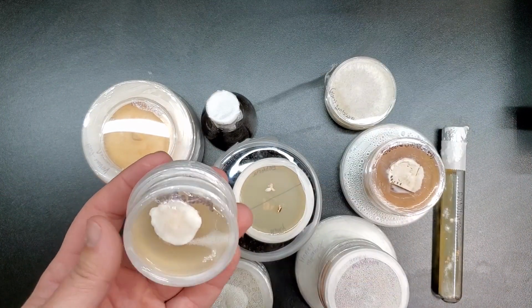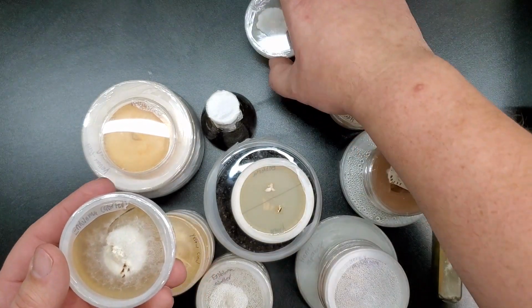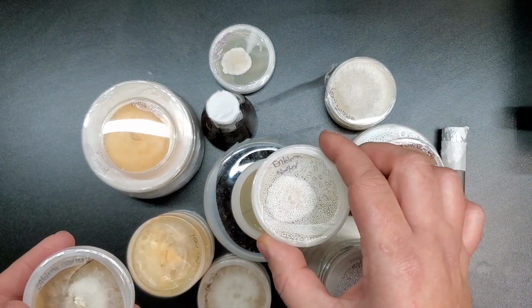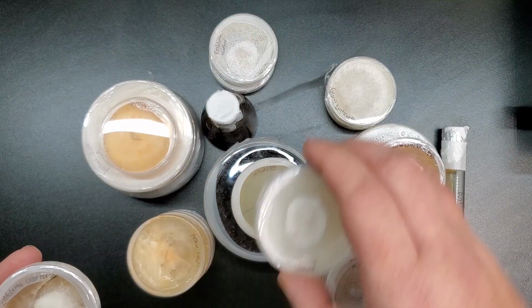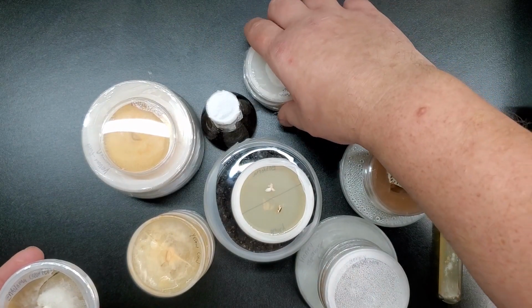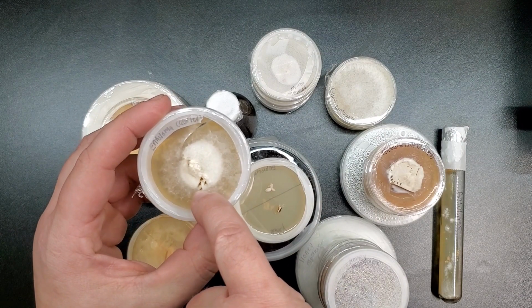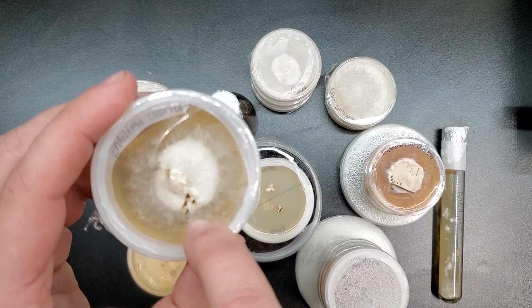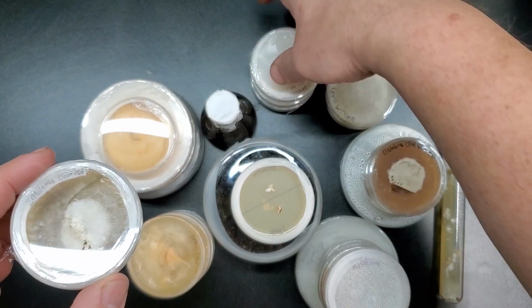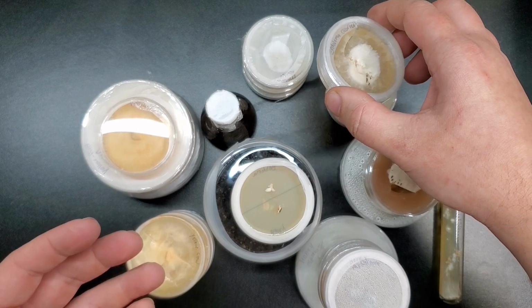And this right here, this is actually a transfer that I did from one of the original petri dishes that I inoculated with tissue sample. Same goes with this one, and same goes with this one. These are all tissue transfers that were from, I think it was this one right here. Yeah, you can see right there where I took some of the tissue, some of the mycelium from this guy, and I used it to inoculate these petri dishes right here. And as you can see, things are actually going really, really well.